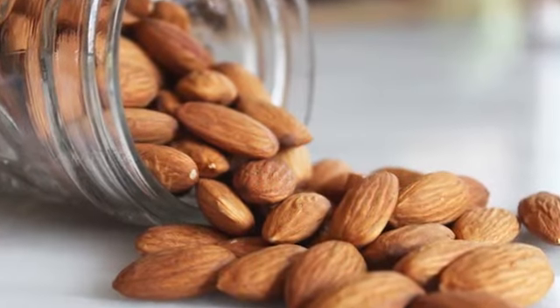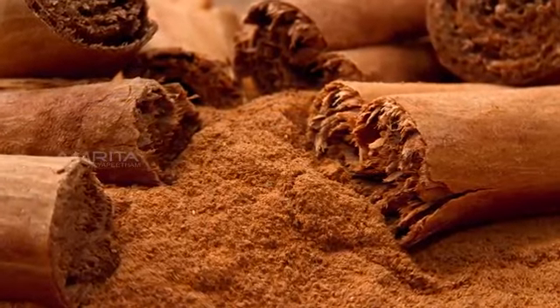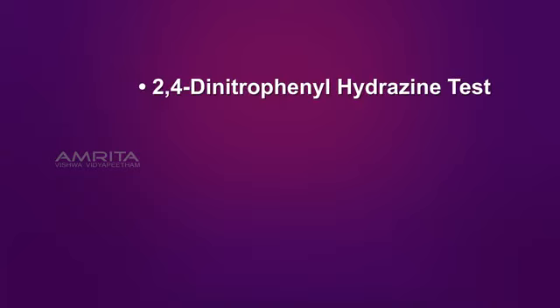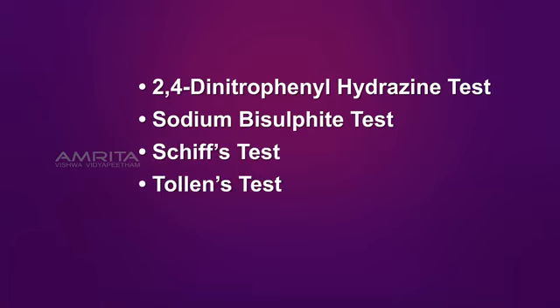The flavors of almond, vanilla beans, and cinnamon are due to the presence of aldehydes. Our aim here is to identify aldehydes using some simple tests. They are: 2,4-dinitrophenylhydrazine test, sodium bisulfite test, Schiff's test, Tollens test, Fehling's test.